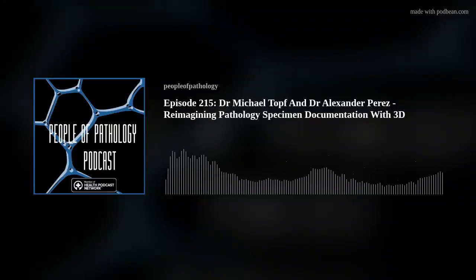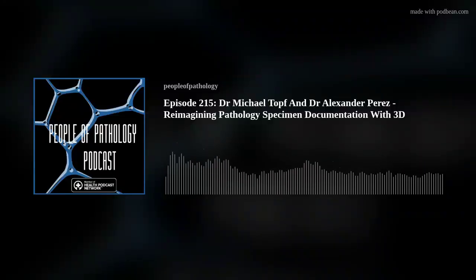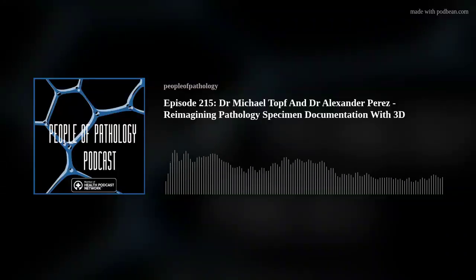Now, in most instances, it's either a medical trainee like the resident, or a pathologist assistant who is grossing the specimen. There's a chance the resident could be present at the sign out for the specimen, but sometimes not. So then they're doing their best to transcribe all the information they're seeing as they're sectioning the specimen and examining all the aspects of it into a document on a flat piece of paper.